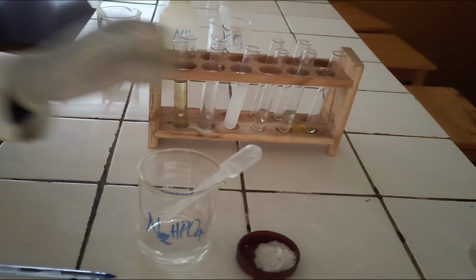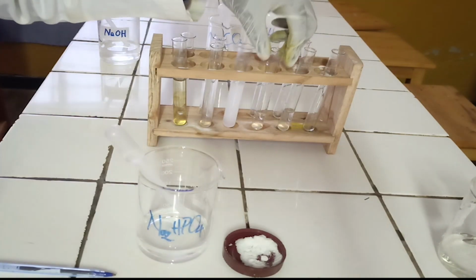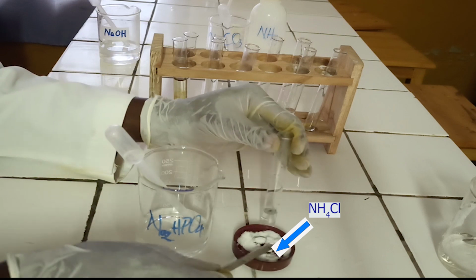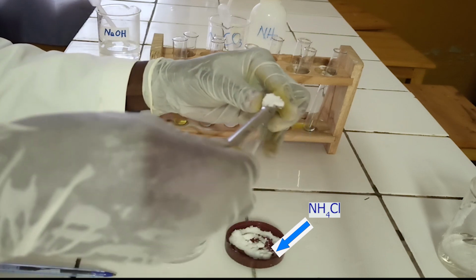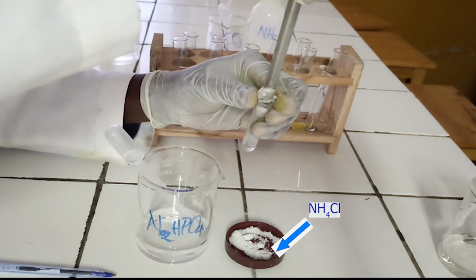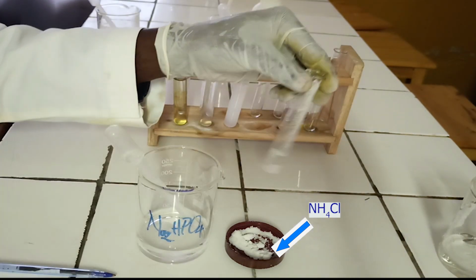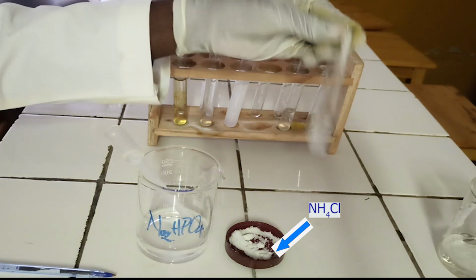Confirmatory test. To the fourth test tube, add solid of ammonium chloride followed by 4 drops of disodium hydrogen phosphate solution, and then add ammonia solution dropwise until in excess.